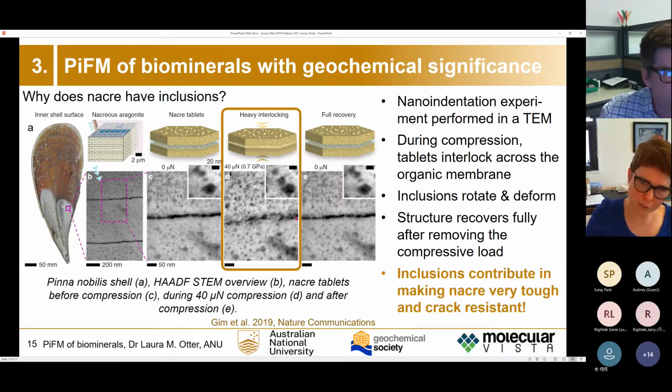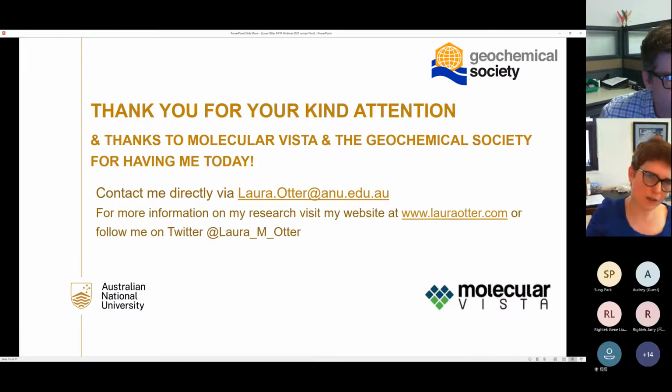So inclusions just complement nacre's mechanical properties and make it actually very resilient and crack resistant. And yeah, this brings me to the end of the talk, and I thank you for your kind attention, and Molecular Vista and the Geochemical Society for having me talk here today.